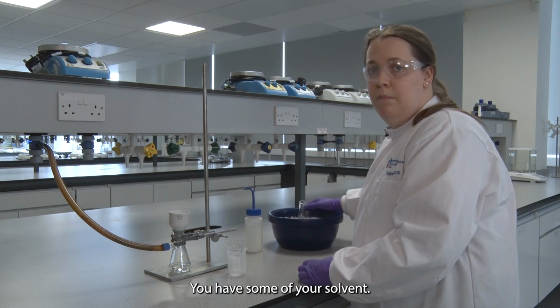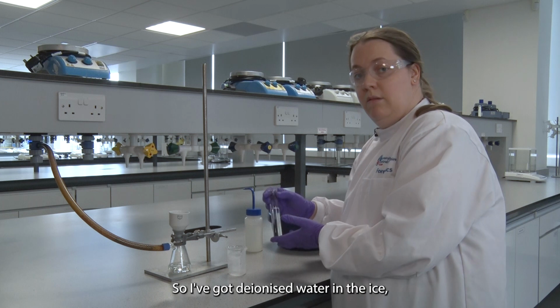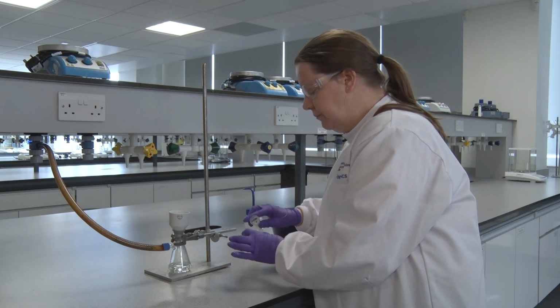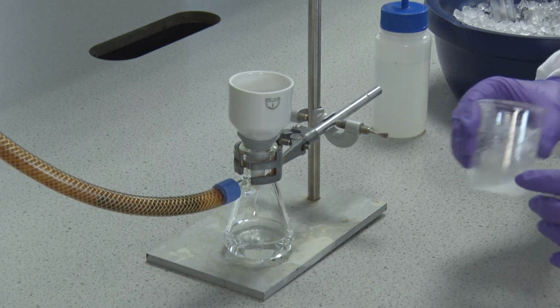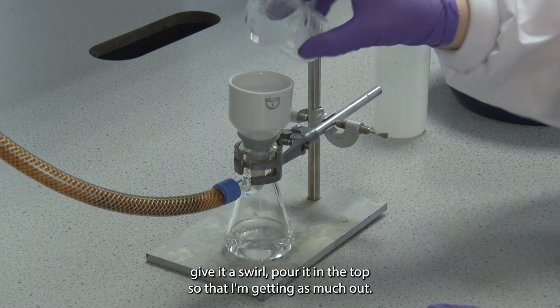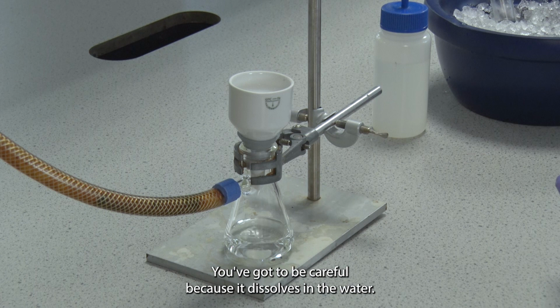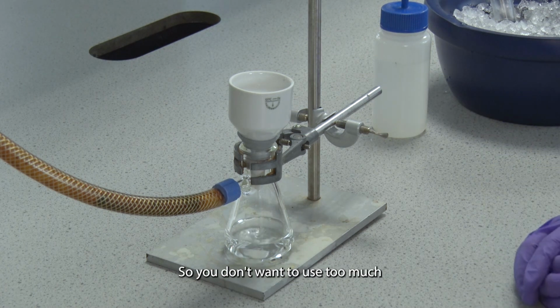You had some of your solvent, so I've got deionized water in the ice, so I've got a little bit of residual product, so I'm going to use a little bit of this ice cold water, give it a swirl, pour it in the top so that I'm getting as much out. You've got to be careful because it dissolves in the water, so you don't want to use too much.